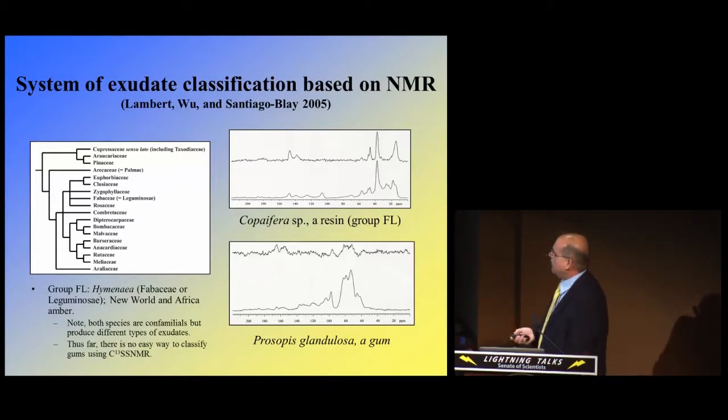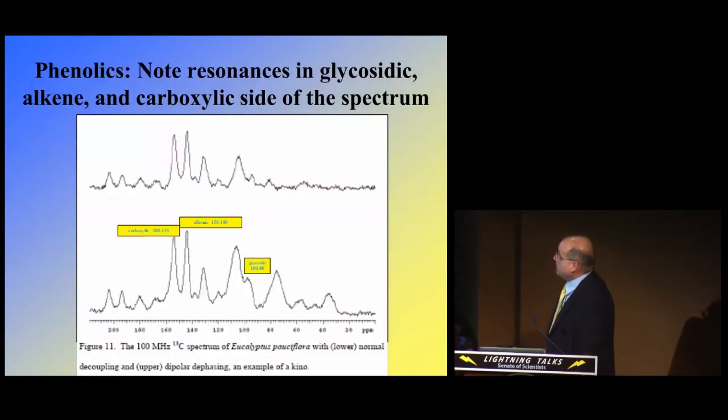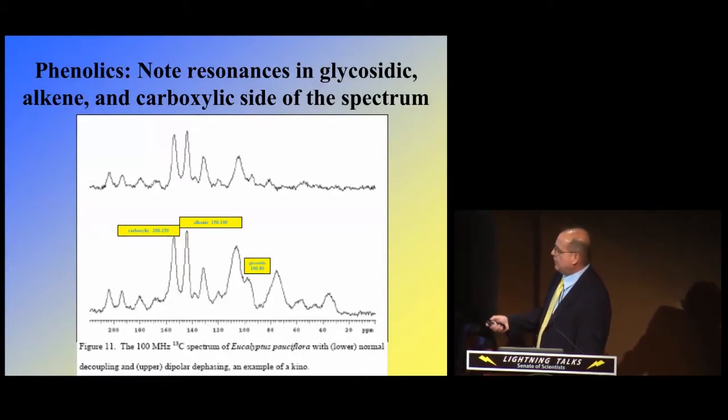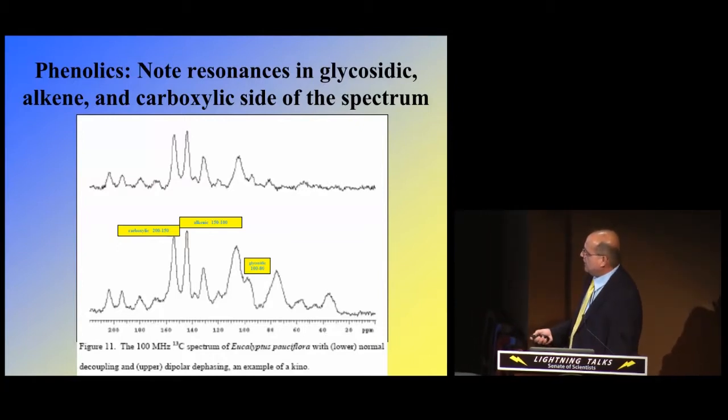So here is an example of how, within a single plant family, the legume family, we have plants that ooze resins. We know that because there are lots of peaks on the right side of the chart. Others have gums. We know that because they have a peak somewhere between 60 and about 90 or so. Others ooze what we have quite recently called phenolics. They have peaks on several regions of the horizontal axis, and please note, very little on the right side of the spectrum.